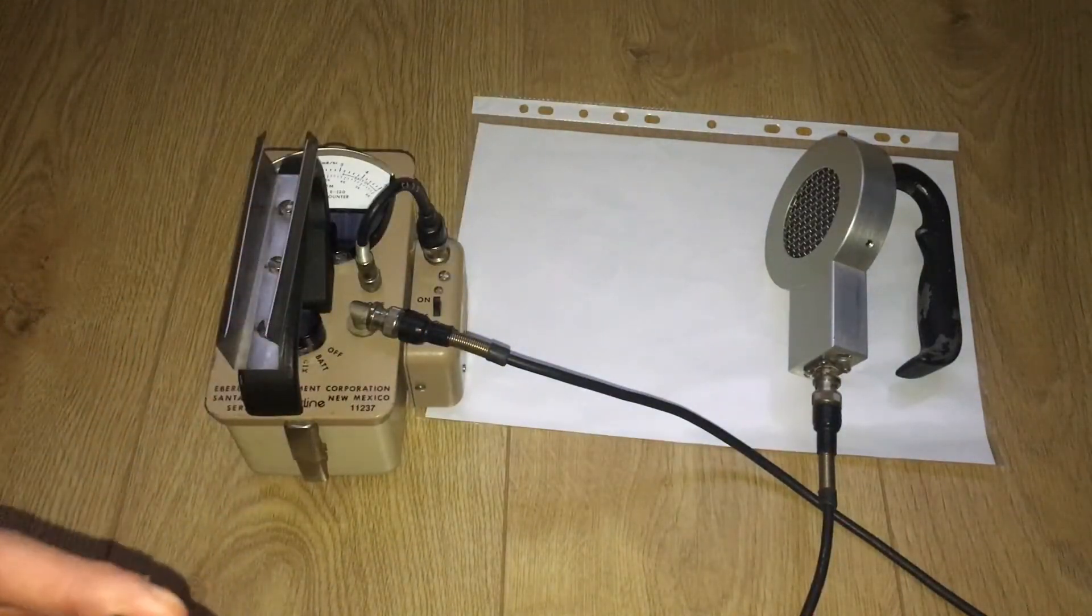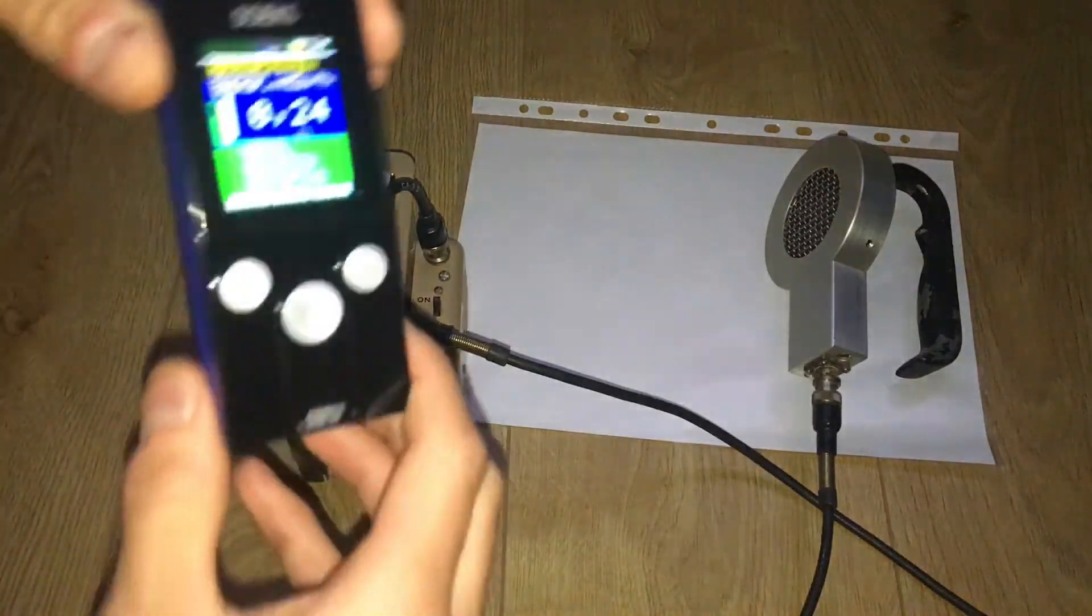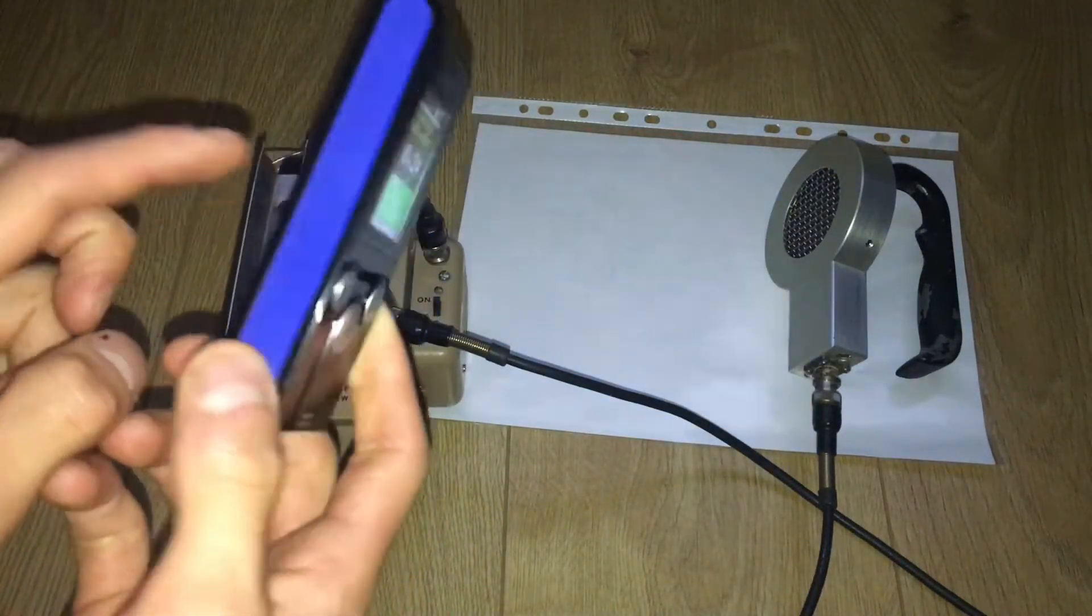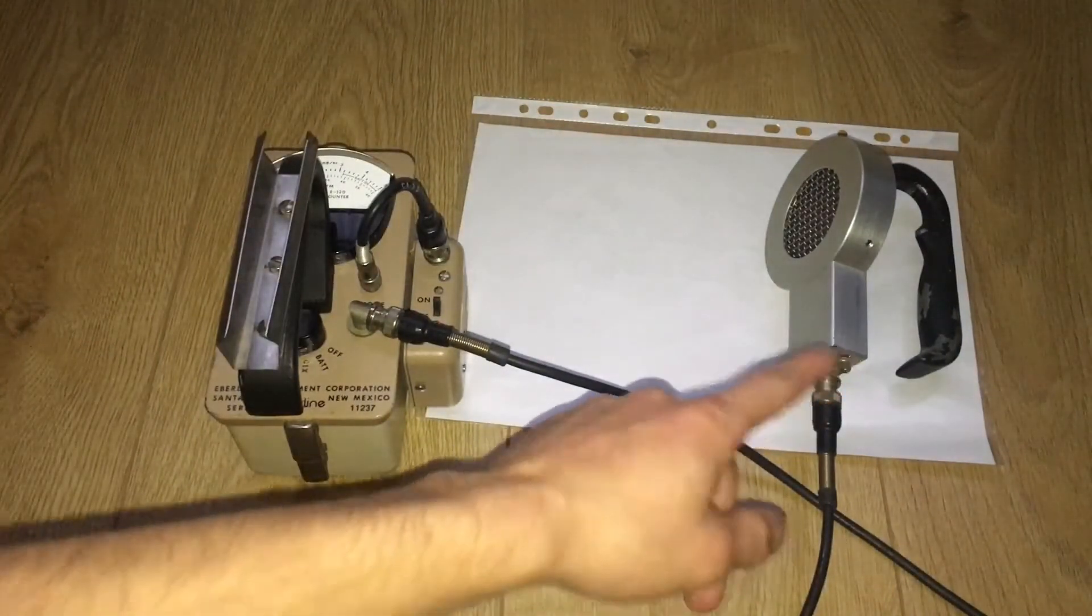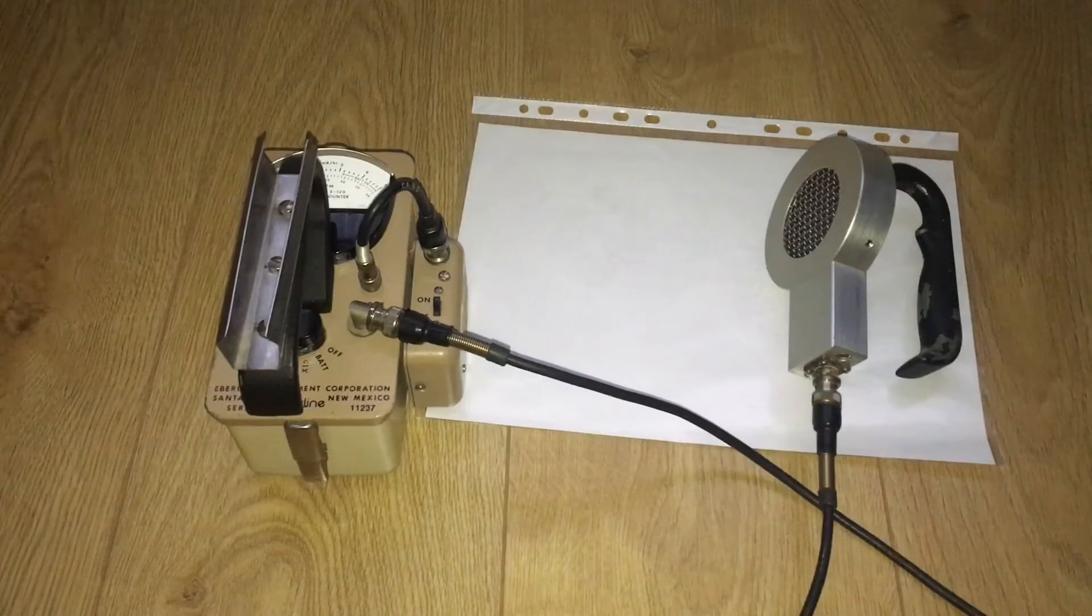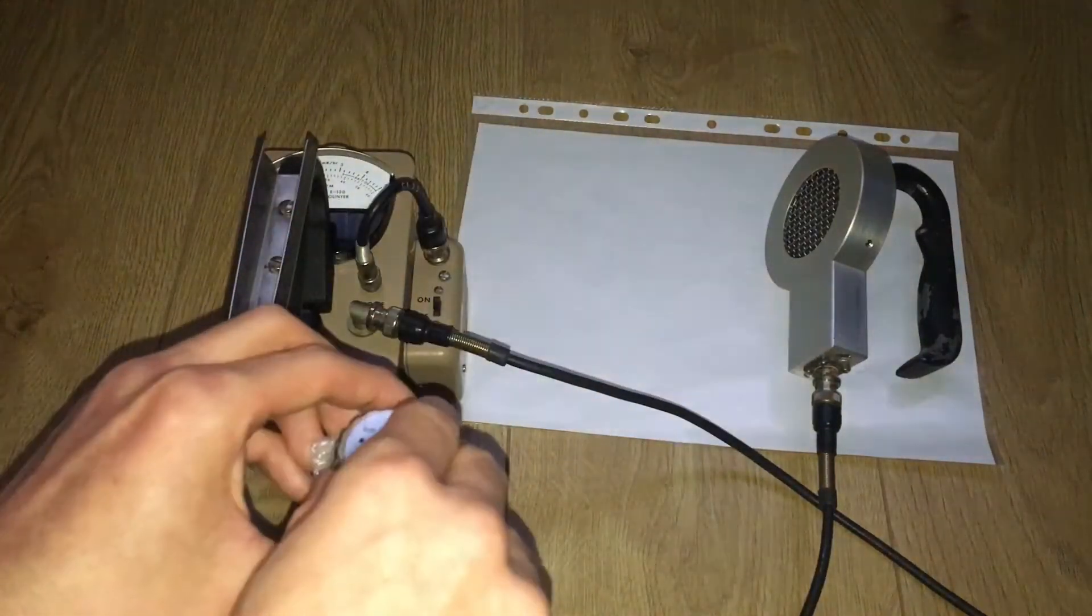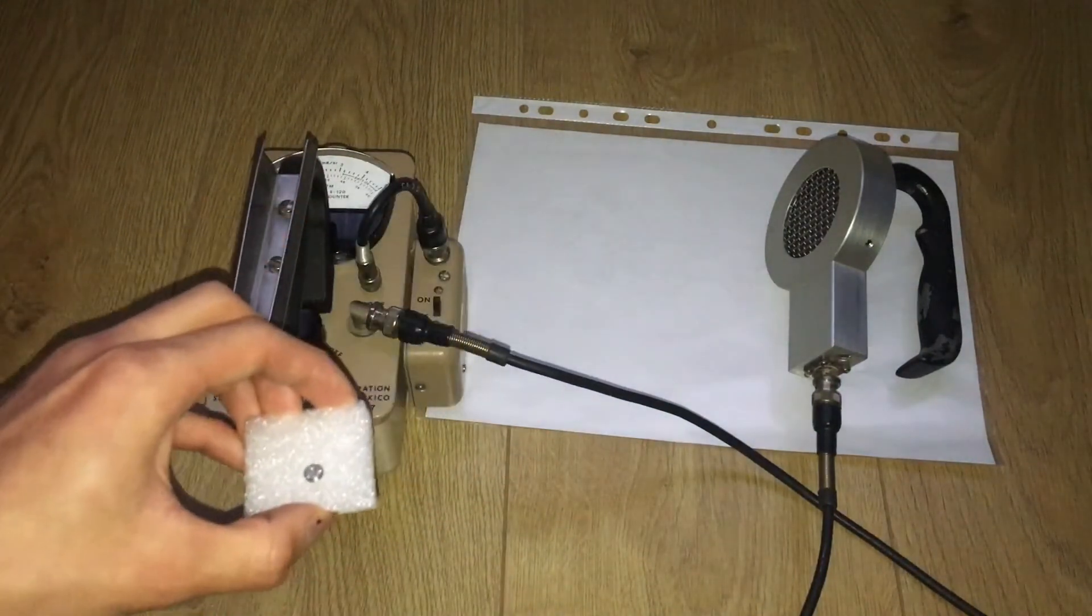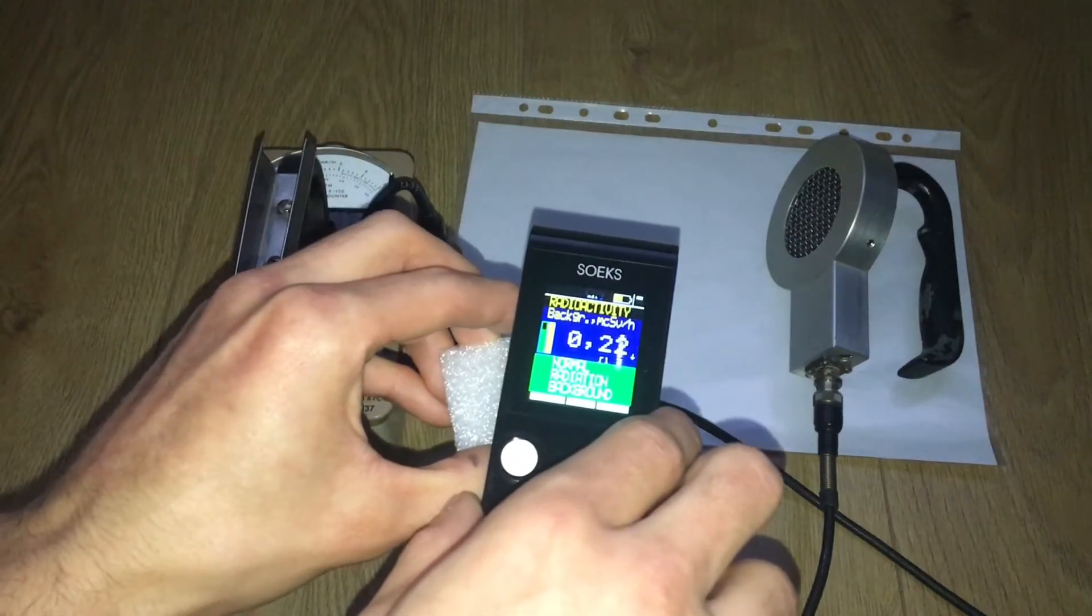So it's good to have a pancake probe compared to a tube that only detects betas and gammas, but the bad point is they are very expensive. We're going to test next some americium-241. There you go, it's detecting.